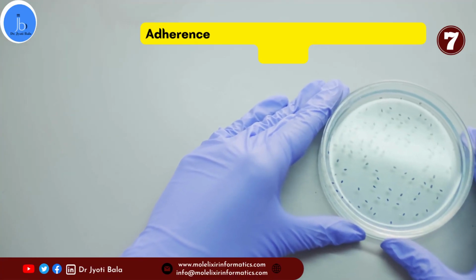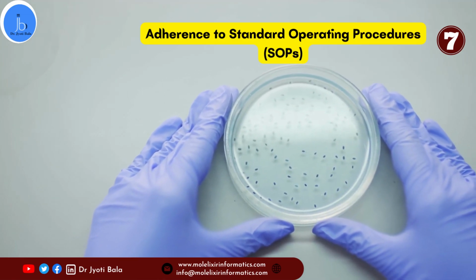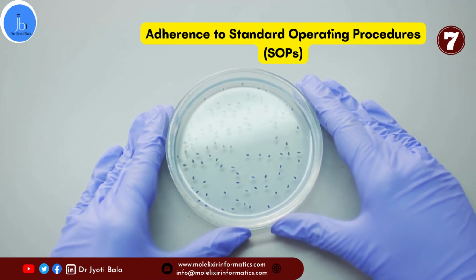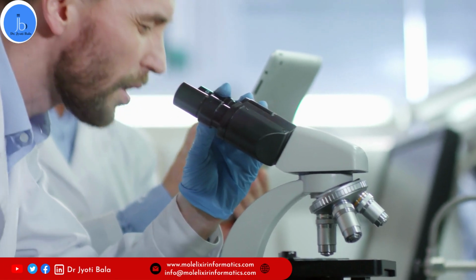The seventh is adherence to standard operating procedures, that is SOPs. Usually, every lab has established standard operating procedures. It is crucial to follow these procedures for all lab activities. Ensure that you and your team are trained in the SOPs and adhere to them consistently.